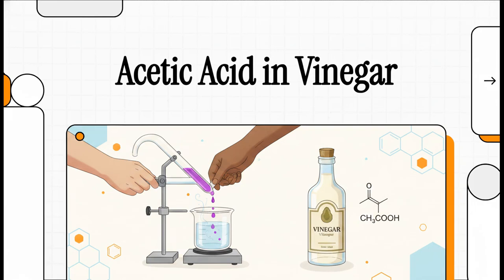I'm your host, and today we're actually stepping into the laboratory for a really fun edition, Dr. Chem's Masterclass. In this explainer, we're going to uncover the true chemical concentration hiding inside a very common item that is probably sitting in your pantry right now, everyday household vinegar.